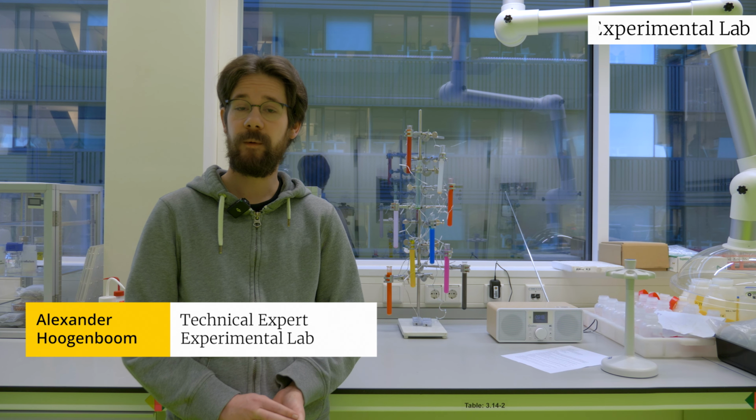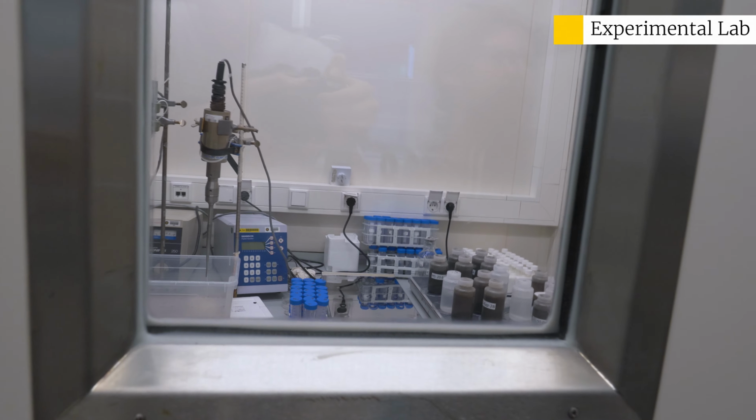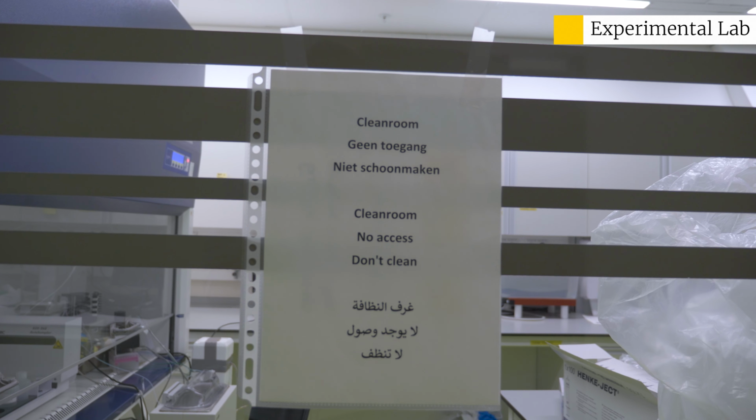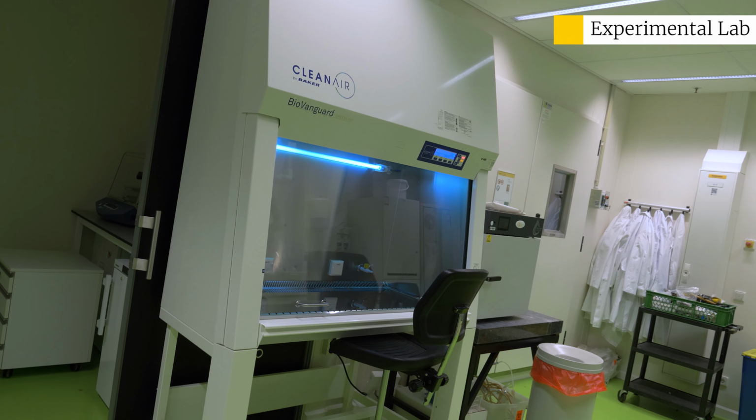In the experimental lab, we provide room and equipment for anything experimental. This includes anything which has non-conventional sample preparations as well as analyses for which no automated machines are available. In addition to the general lab equipment, we also provide climate chambers, glove boxes, clean rooms, as well as a biosafety level 2 lab, which can be used to grow bacterial cultures.